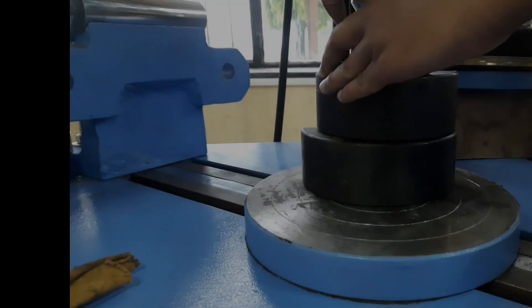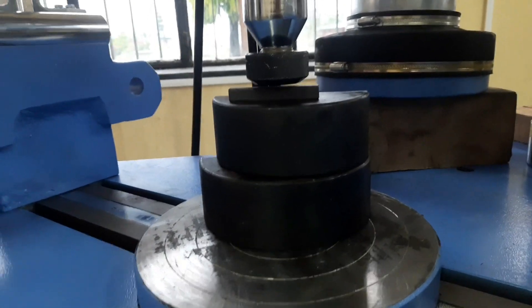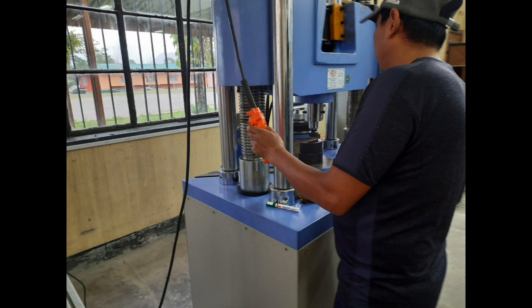A suitable height is maintained between the attachment and the bottom cross head and the specimen by the use of the controller. The controller is used to control the movement of the cross head.